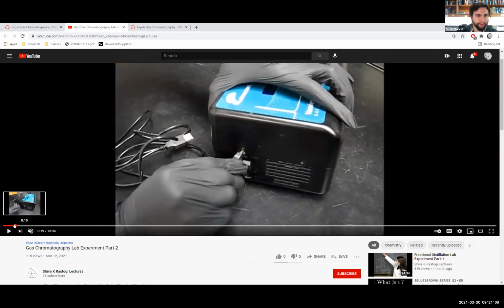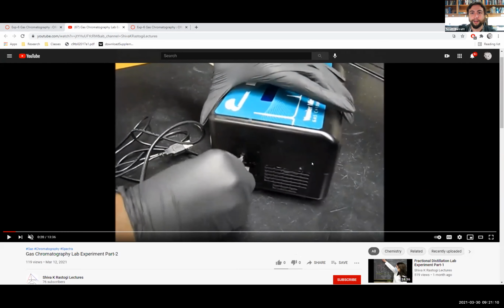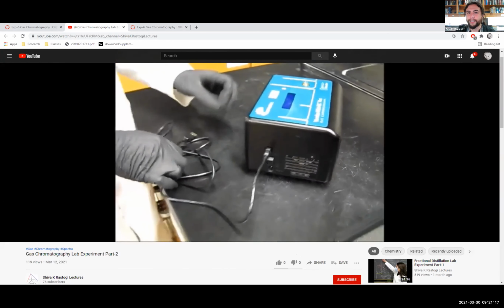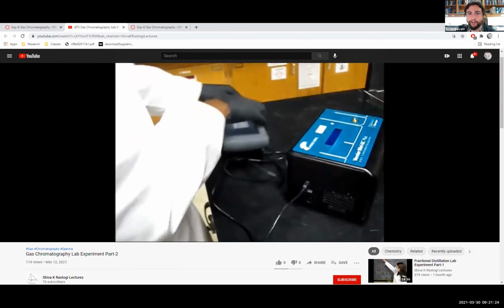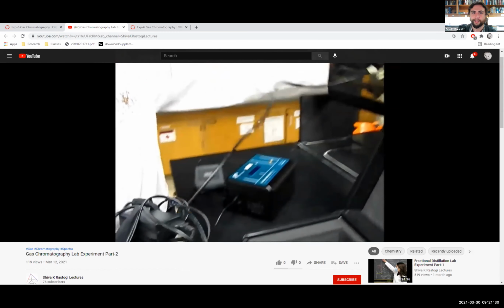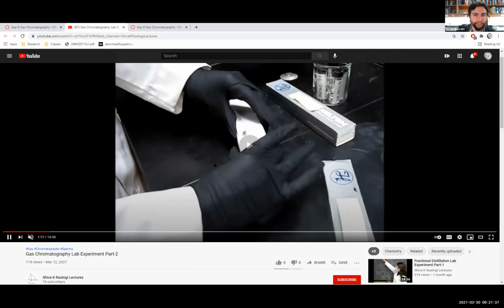So firstly, we're going to jump over here to the 20-second mark. This machine here is your Vernier mini gas chromatography machine, and they're setting it up in order to plug it in and have it attached to our LabQuest. Here's our LabQuest. Everyone's familiar with this, probably from Gen Chem at this point. So we plug it into our mini GC, and then here's our adapter to have this plugged in. I'm going to go ahead and skip forward because, like I said before, a lot of it's just preparation.